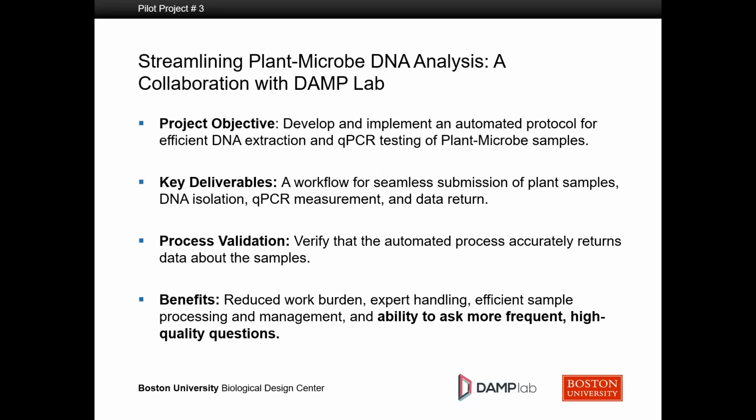We wanted to develop and implement an automated protocol for efficient DNA extraction and PCR testing of plant microbe samples. The deliverable was going to be a workflow for the seamless submission of the samples and the data return ultimately. We wanted in this pilot to validate that we could submit samples whose composition we knew into the process and get that back through the data, to work towards these benefits of reduced work burden, expert handling, and ultimately leading us to the ability to ask these more frequent, high quality questions.